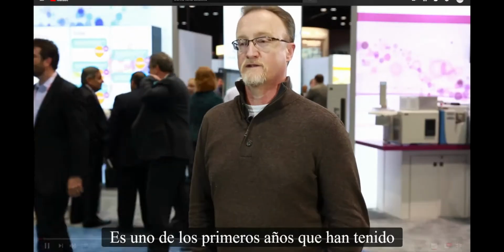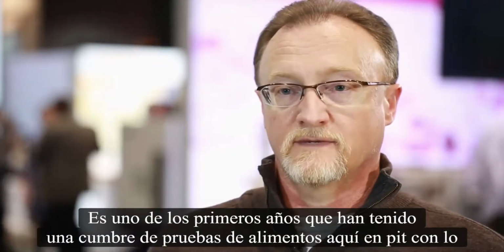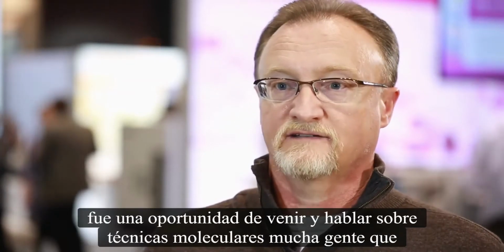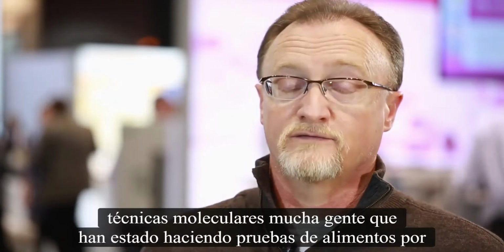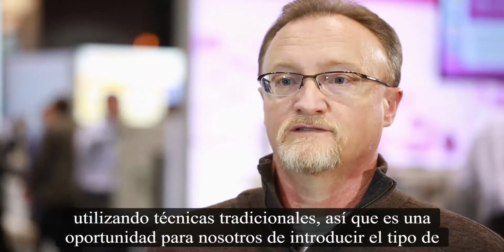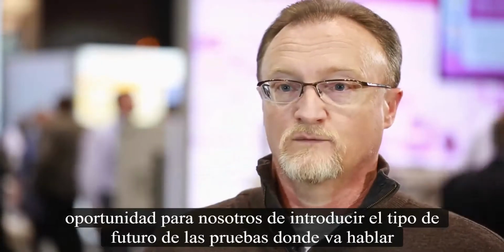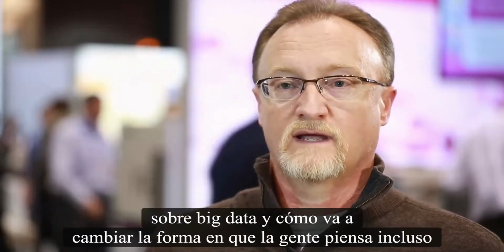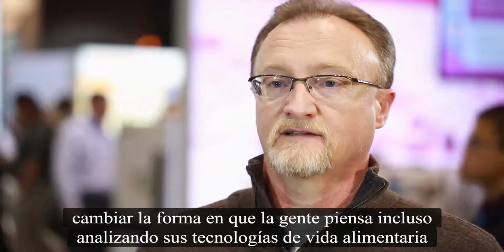It's one of the first years they've had a food testing summit here at PitCon. So it was a chance to come and talk about molecular techniques. A lot of folks that are doing food testing are using traditional techniques, so it's a chance for us to introduce kind of the future of testing, where it's going, talk about big data and how it's going to change the way people think about even analyzing their food.